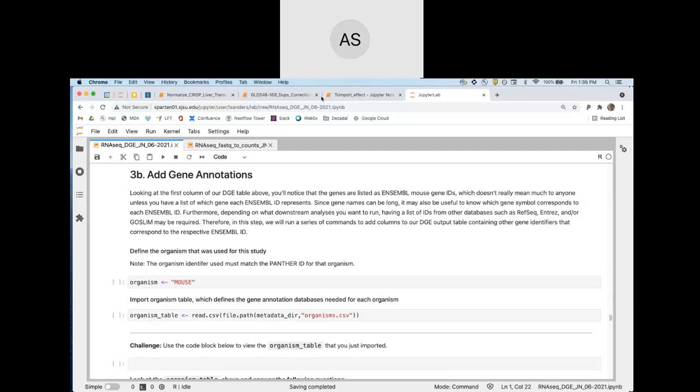reads that contain UMIs. So in GeneLab, it's our standard to include UMIs in our sequencing, so that way we can account for duplicated reads. However, we accept data from any spaceflight omics experiment, and so not everyone will include UMIs. And we actually have not completed a standard pipeline to identify and remove UMIs. So that's a project that some of you are going to be working on over the summer. So we won't do that here, though.